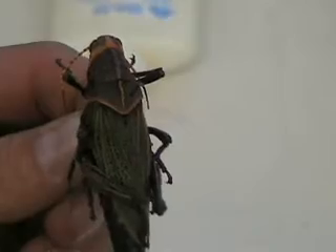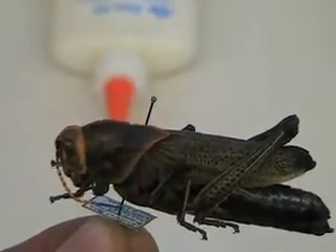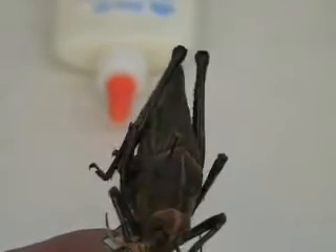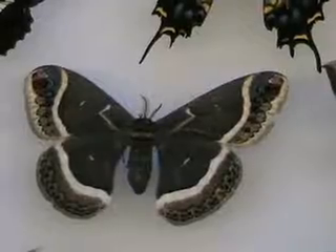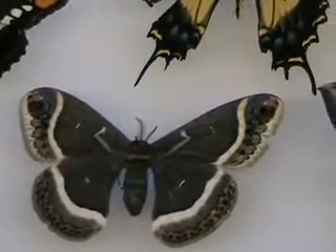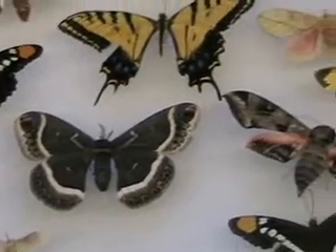With grasshoppers, they have a ridge on the prothorax, and you obviously can't pin it right through the ridge — you want to pin it on the right side of that ridge. There are also moths, butterflies, and other Lepidoptera; those you would pin through the center of the thorax.